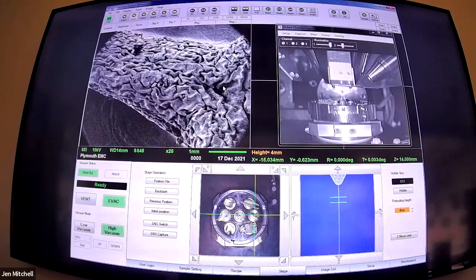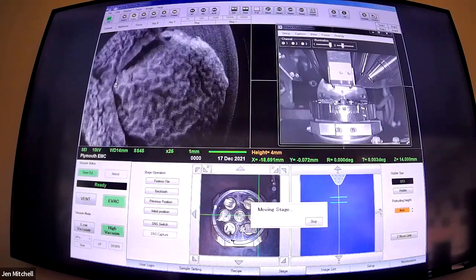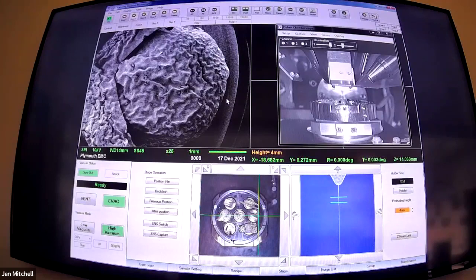Feel free to take a guess. It helps if you know what you're looking at, but if you don't it looks like a brain. I'm not almost as in the dark as everybody else because I vaguely know what's in there since I helped do the samples, but I don't know what's what number. It would help if you could smell it. Natalie crushing it today - it is a clove.